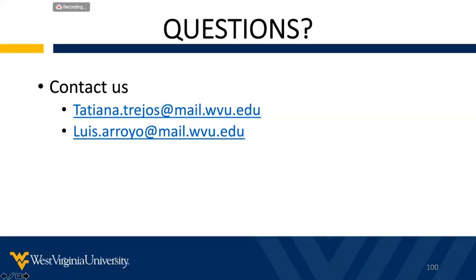Okay, next question can go to either one of you in regards to the overall study. How close were the non-shooters to the shooters? So this is a good question. We haven't done non-shooters in the proximity of shooters. We haven't done that yet. So the background samples that we described are all what we call a low-risk population.